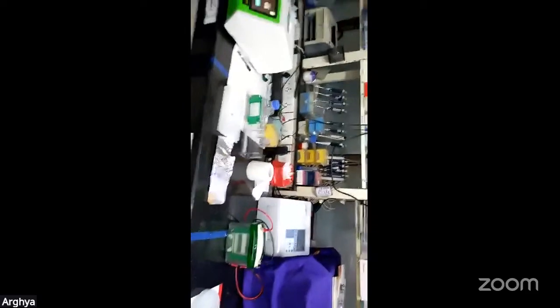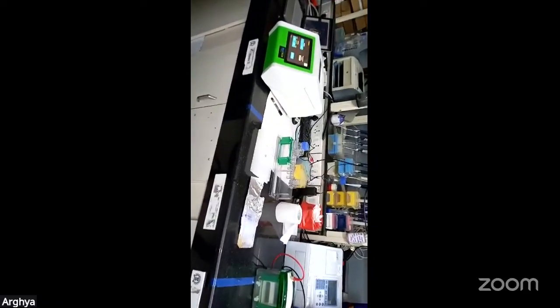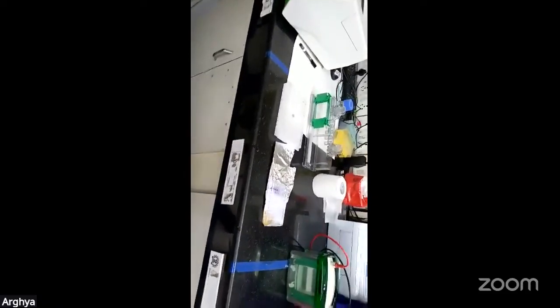So what apparatus you can see here. This is the proper clinical bench setup where we follow the aseptic conditions with the lab coat and all those things. And only one criterion keep in your mind: you have to be cold and precise and very clean. Many contaminations can happen, like keratin contamination, so wear gloves while handling the samples.